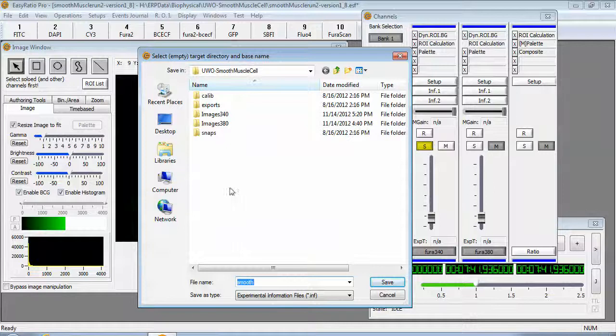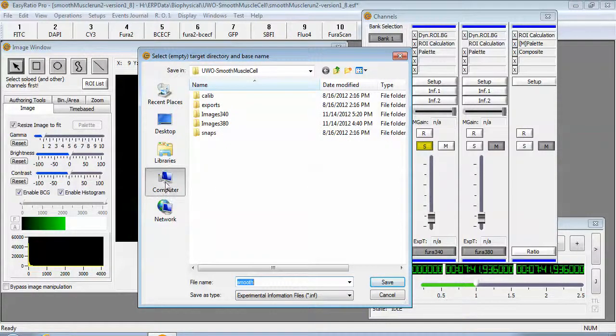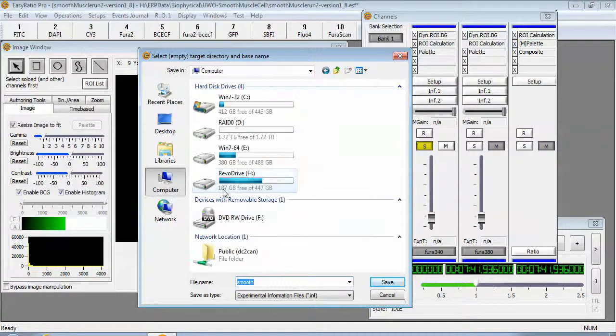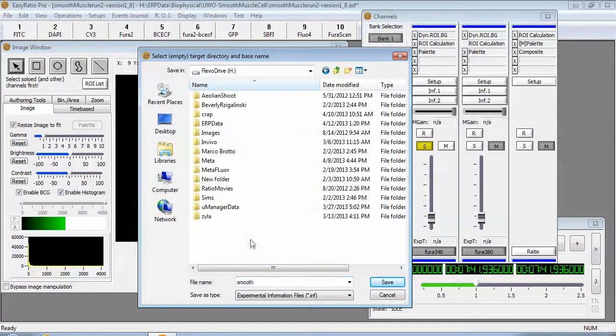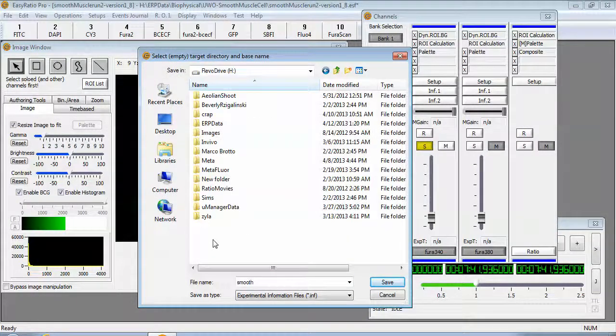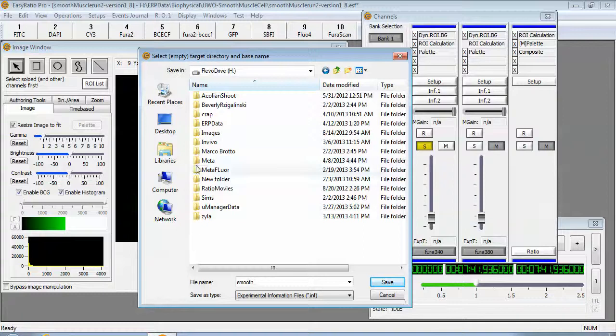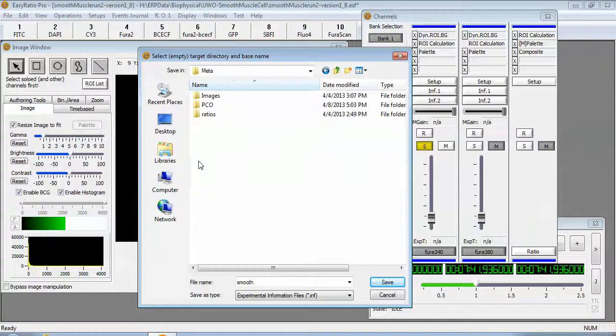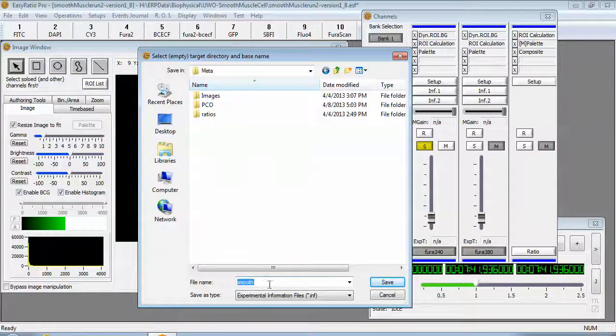You'll then be asked to select a directory. Choose your fastest hard disk and a directory to put the files into. I'm going to choose meta here.